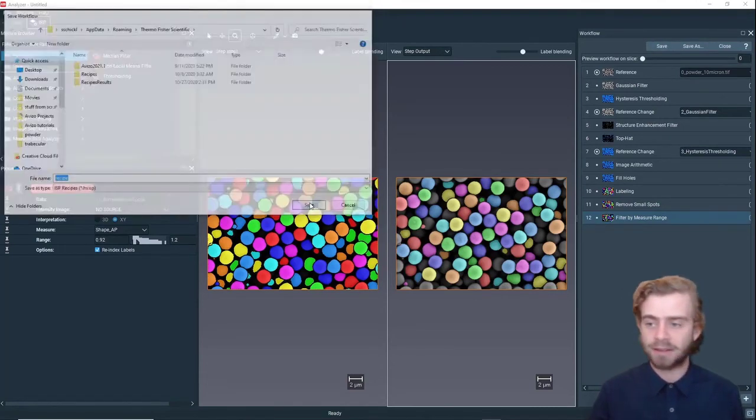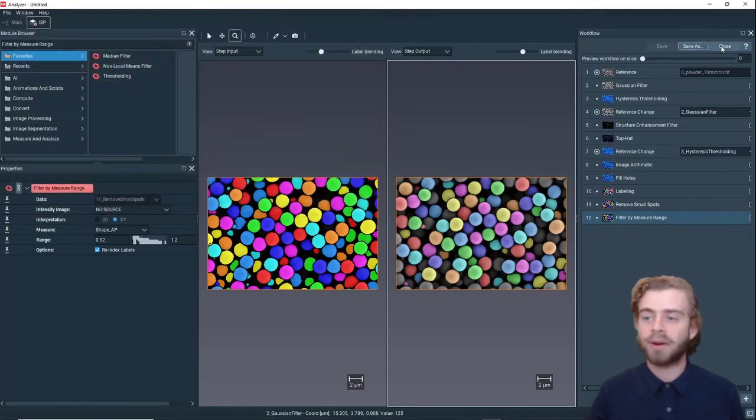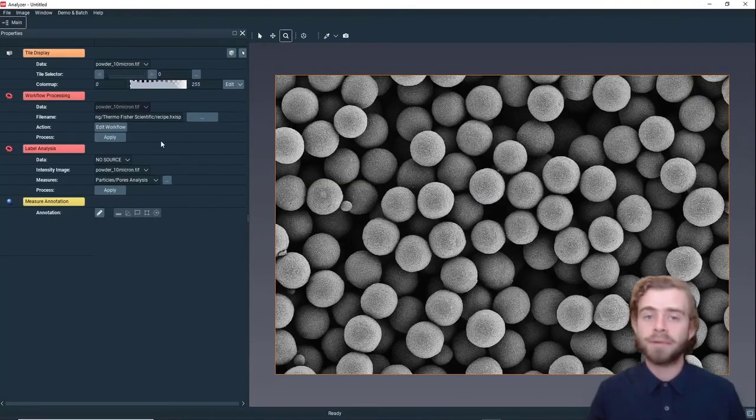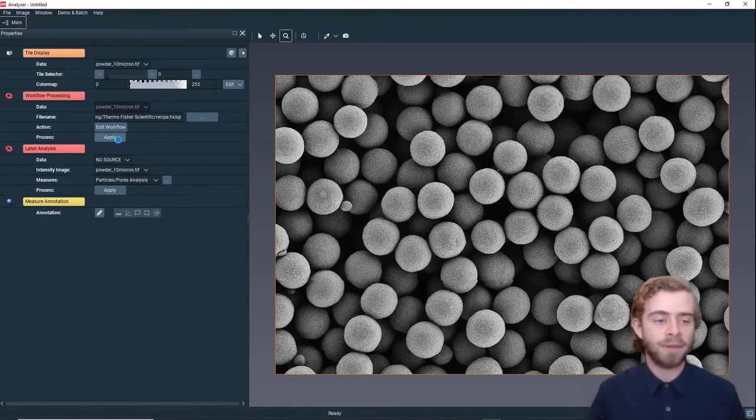Now that we've done that, we're going to save the workflow. Click Save, save it as Recipe, click Save, and then click Close. To apply the workflow, all we need to do is click Apply.